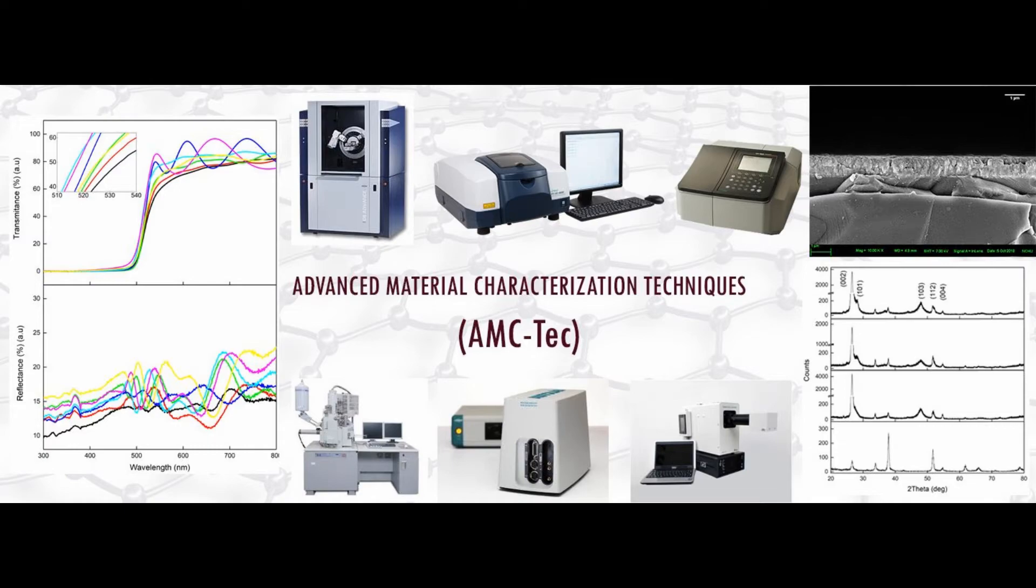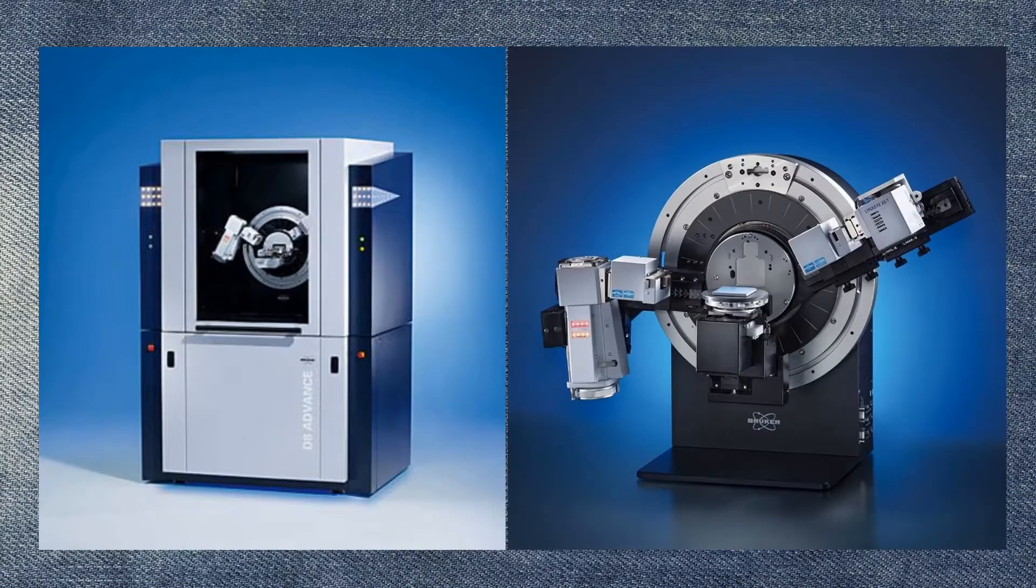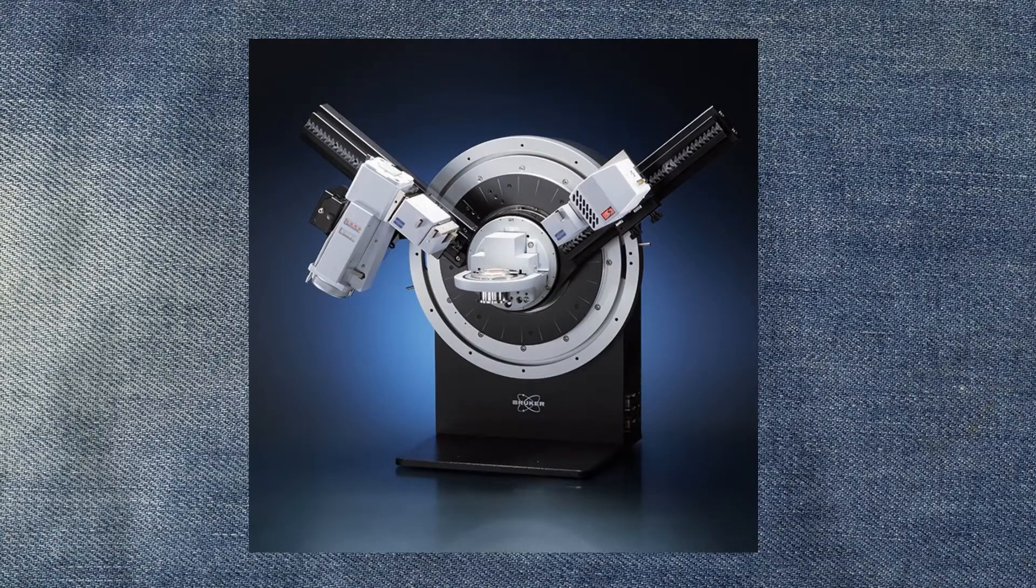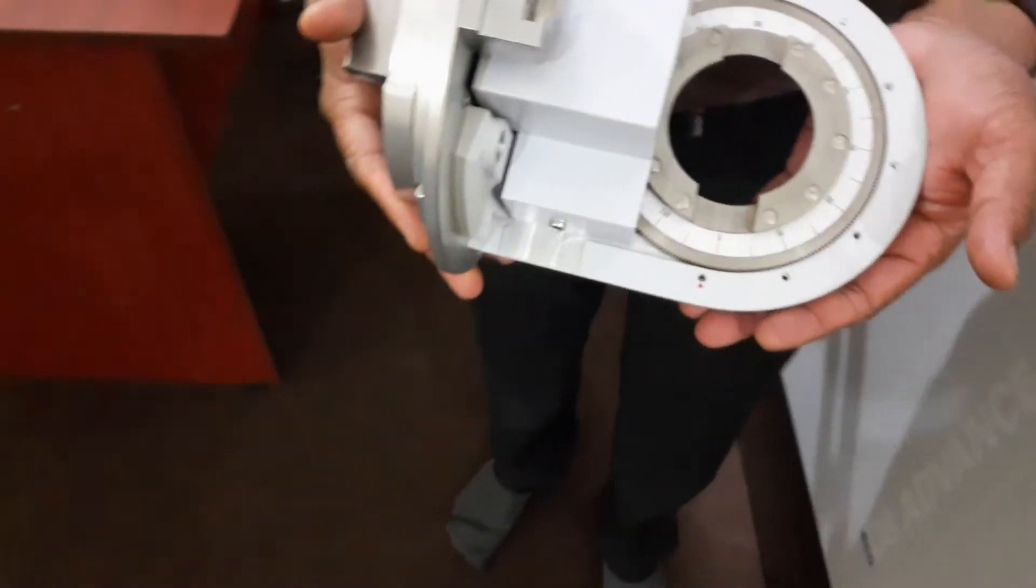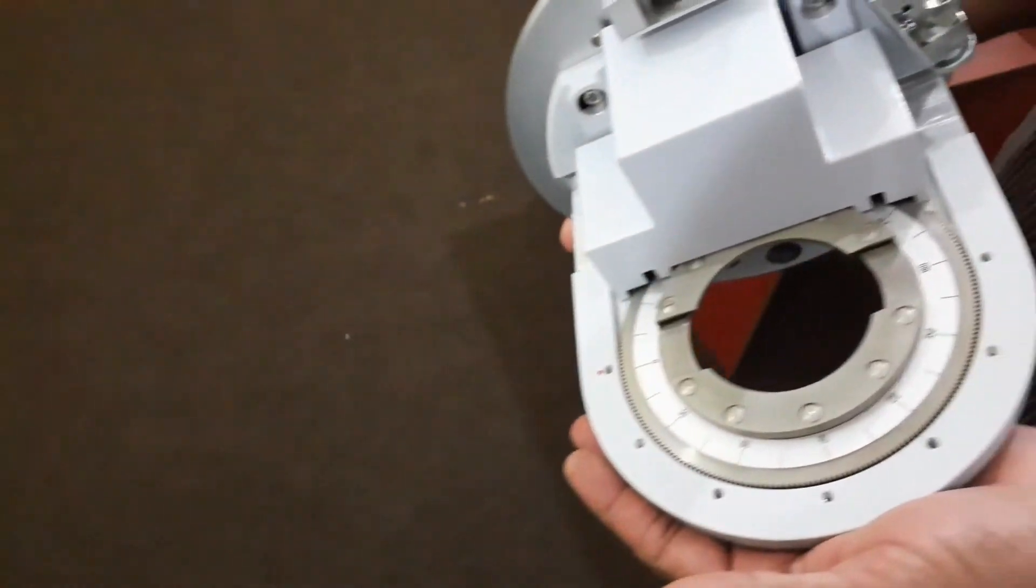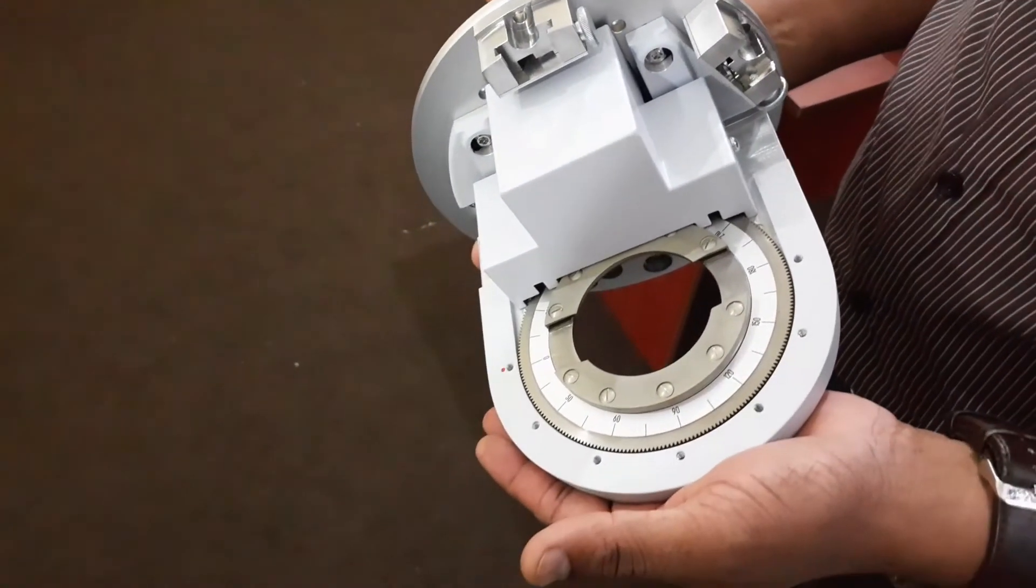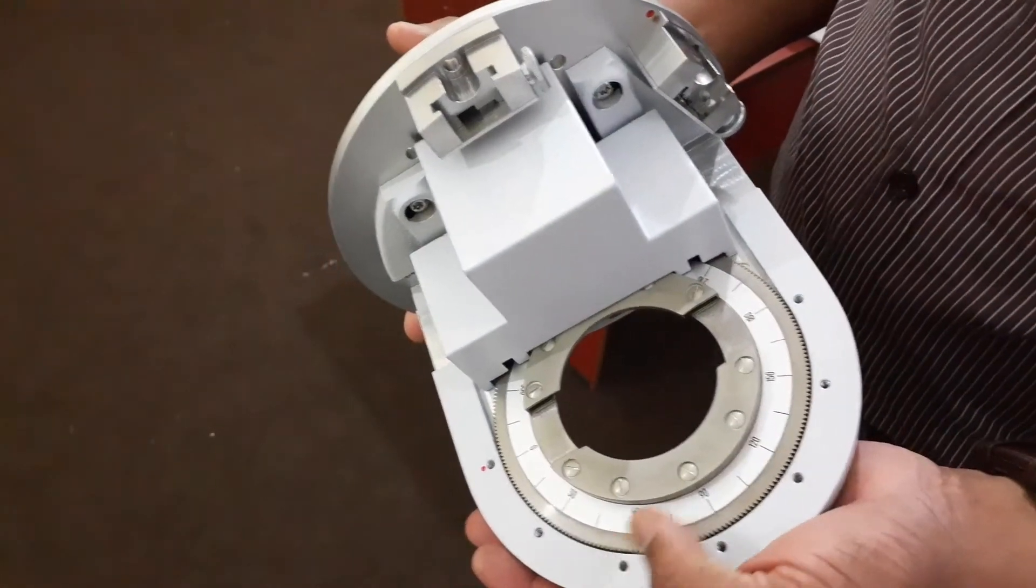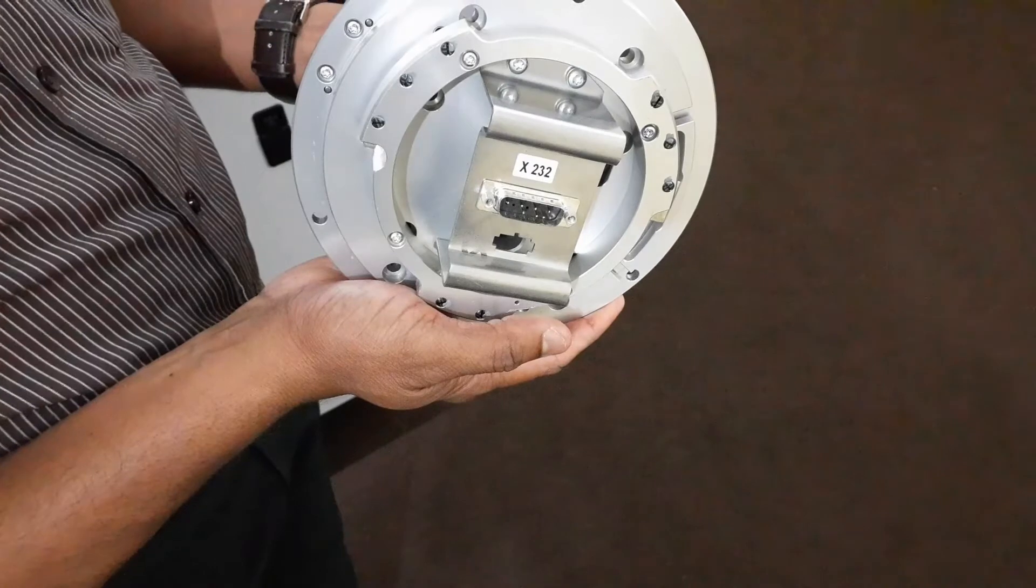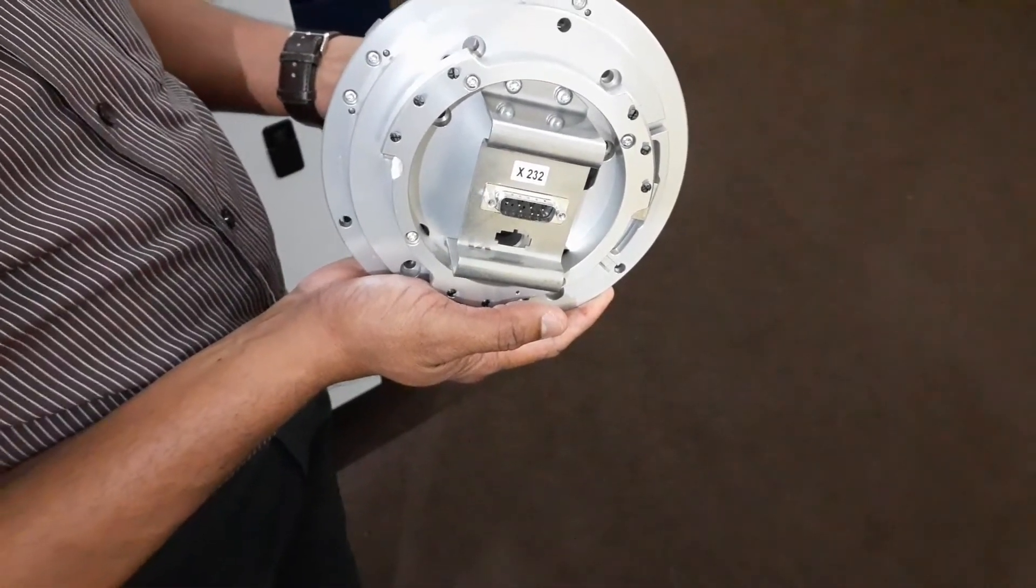Hello everyone, welcome to the AMC Tech video series. In the previous video I discussed how to remove the XYZ stage from the goniometric system. In this video I will show you how to install the rotational powder sample stage. This is the rotational powder sample stage. This is the connector between the stage and the XRD machine.